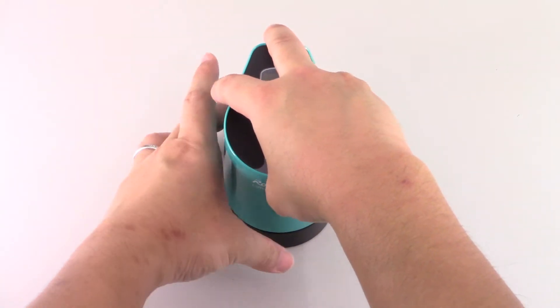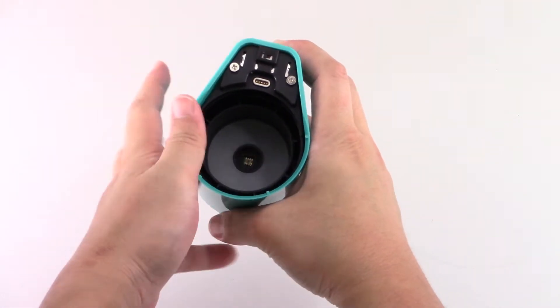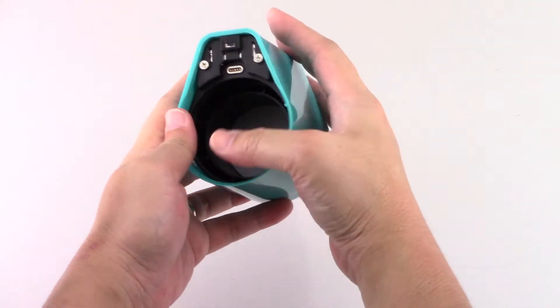Let's start with measuring the coffee beans. Separate the analyzer unit from the base, and make sure the device is powered on.